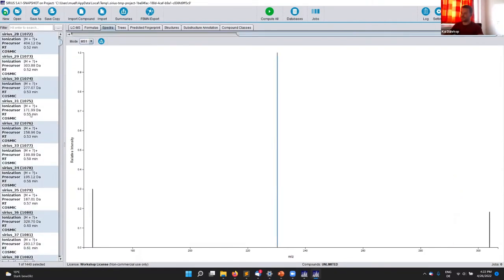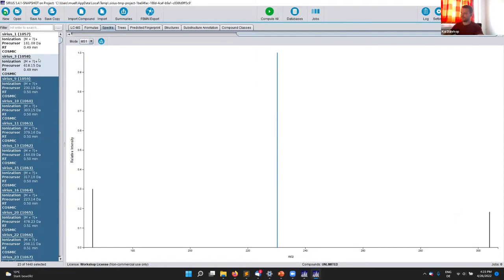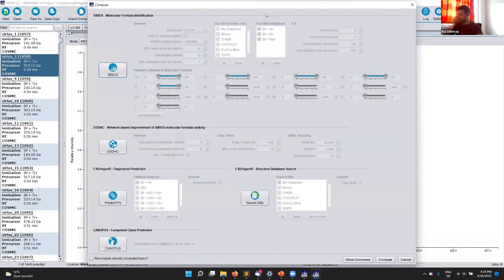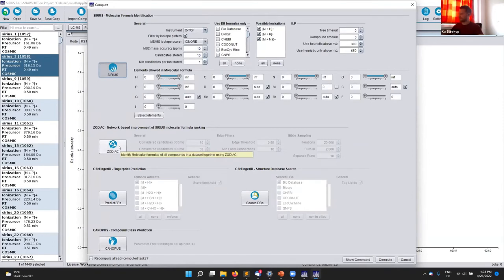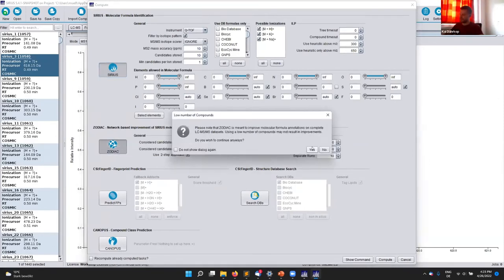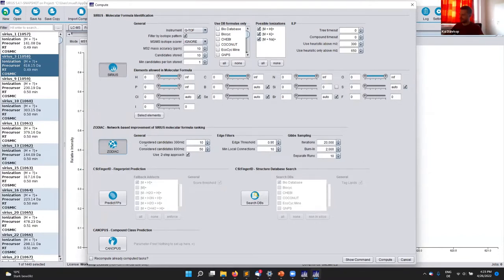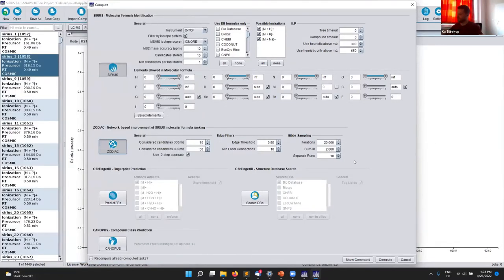You can compute several components at once — just shift-click to select them, or click compute all. The problem is computing the complete dataset. Now you see there's an additional tool here, Zodiac, because if you only annotate a single component you cannot use network analysis — this button only appears when you compute all the data. You can always ignore the parameters. We won't compute all the data now because SIRIUS takes quite a long time — for a dataset with 1000 components it might take hours. But basically, you click on SIRIUS, then Zodiac, then compute, and it runs all compounds.